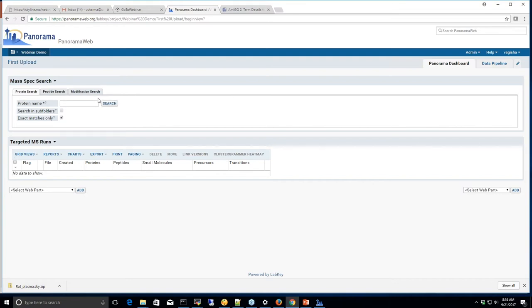I've already created one experimental data folder. This is a new folder I created for this demo. There are two boxes here: a mass spec search box where you can type in your protein or peptide sequence to search all Skyline documents uploaded to this folder, and below that, the Targeted MS Runs box, which will contain a list of all Skyline documents uploaded to this folder. Right now there's nothing, so I'm going to upload something.